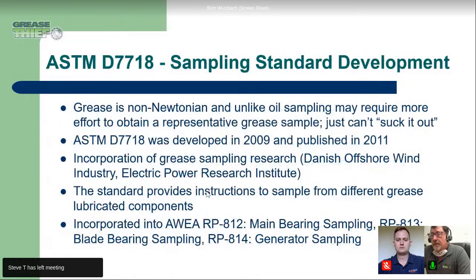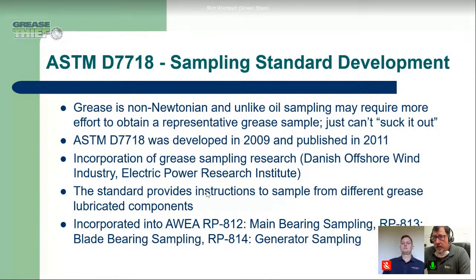Yeah, so the standard development that I've talked about really goes to addressing that grease is quite different than oil. And unfortunately, historically, sometimes grease just gets treated as if it's just a thicker oil or something like that. All we've got to do is grab it and hand it to an oil lab and tell them to do whatever they need to do to get some results to us. But grease is not the same.